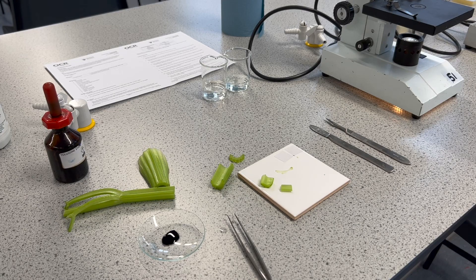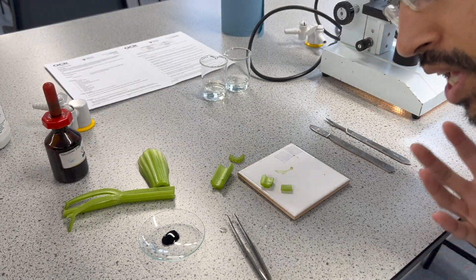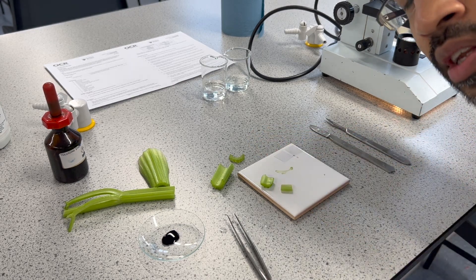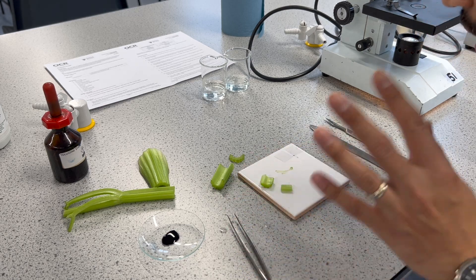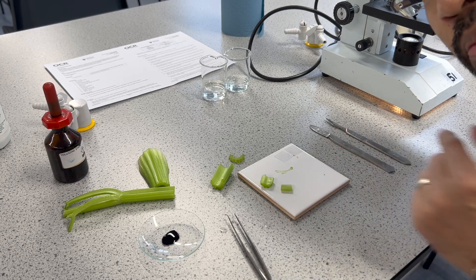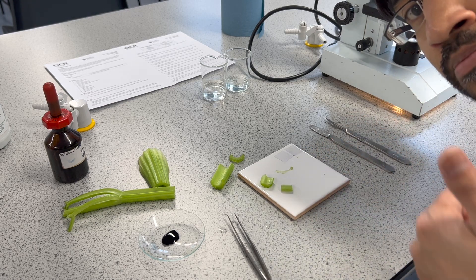Hello, it's Dr. Bhavsar. Today we are going to do stem dissection with celery, and we are going to do some staining and observing vascular bundles — that's xylem and phloem — under the microscope, and also doing some magnification calculations. Let's get started.